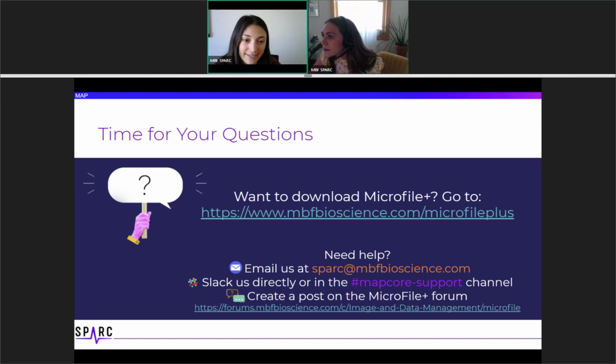Thanks, Macy. It looks like we do have one question so far. I'll read that off, and maybe you can take that, Macy. Okay. The question is, if I have pictures of my experimental protocol of sample preparation, for example, do these images need to be converted and abide by the SPARC image standards?